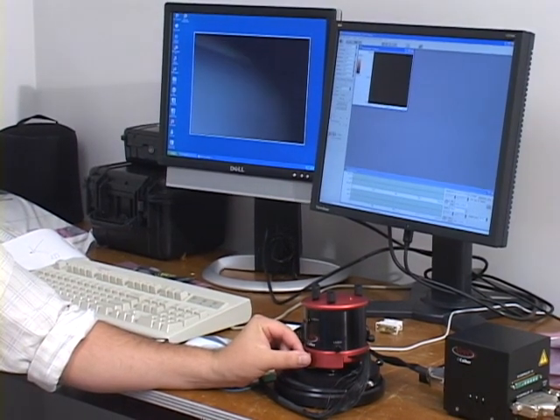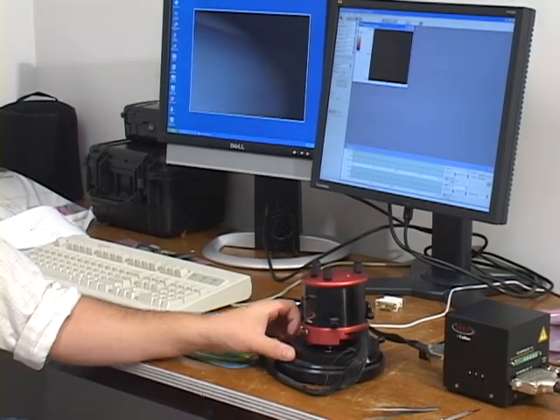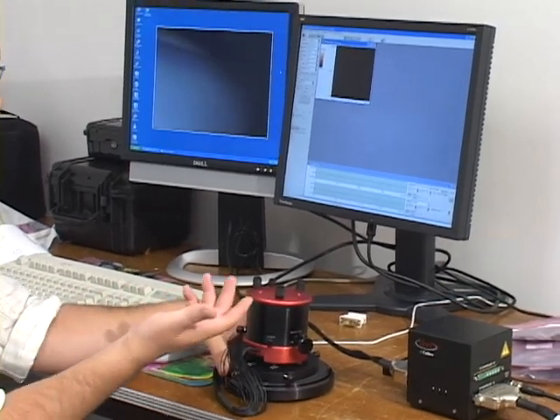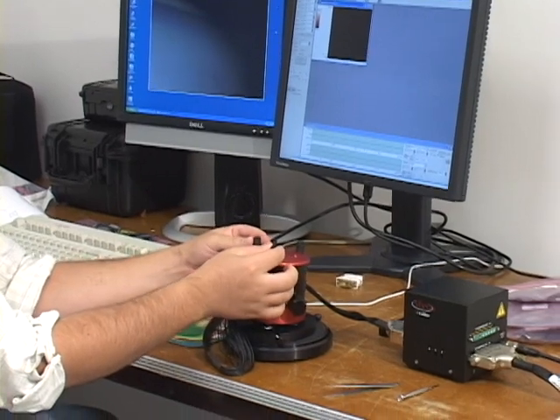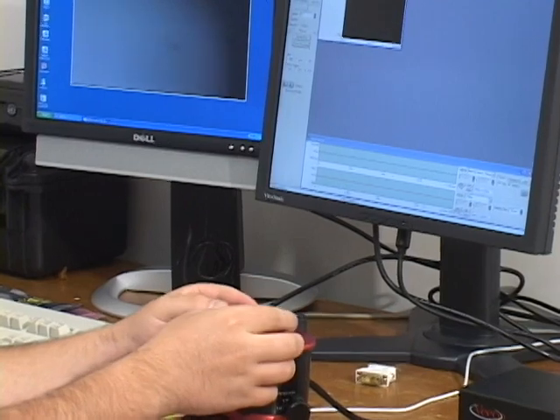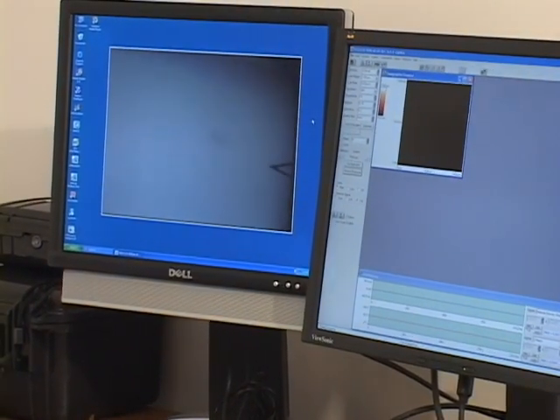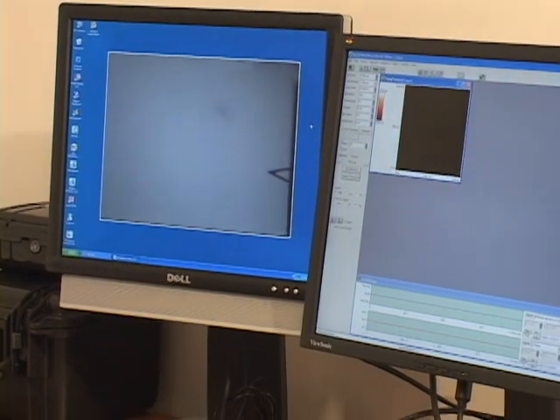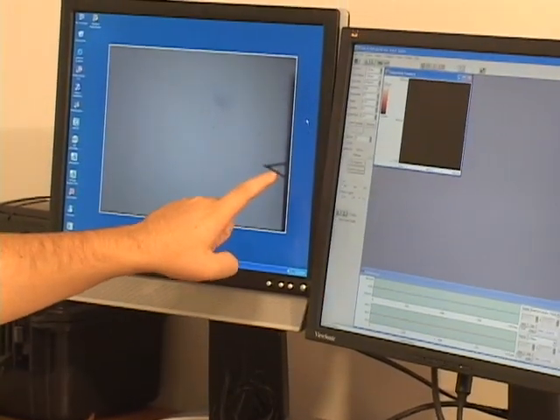So we'll get more like there. We're too far from the surface to get the reflective light onto the probe. So we'll have to bring down both screws, both manual screws, at the same time till we get closer to the surface. So we'll be able to see something. So we brought it a lot closer. Now we can see the probe right here on the edge.